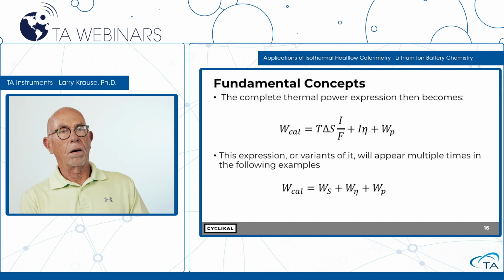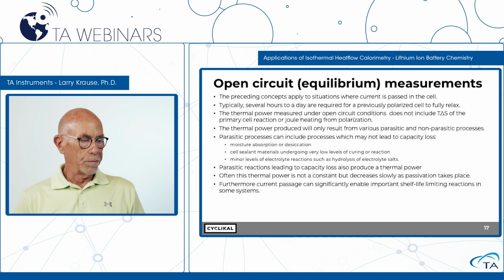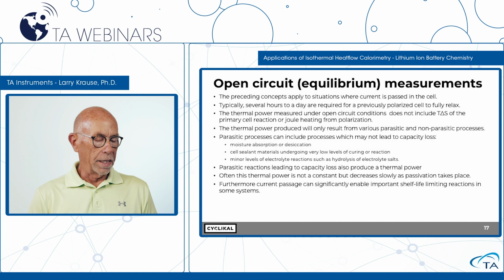All right, so that applies to when you're doing electrochemical measurements in a cell, cycling, discharging a battery. All the preceding concepts apply to a situation where current is passed in the cell. Recognize, though, that several hours to, say, a day are required for a previously polarized cell to fully relax, to let all these gradients relax.